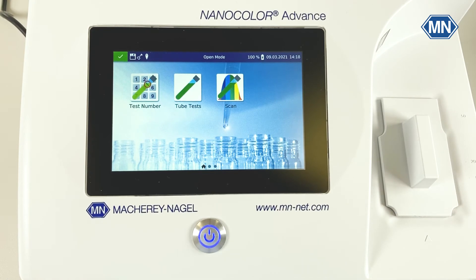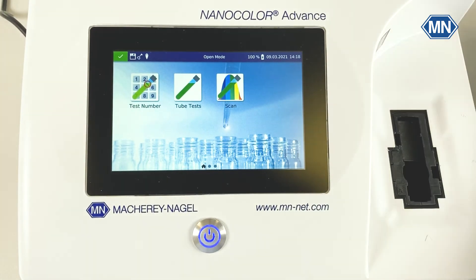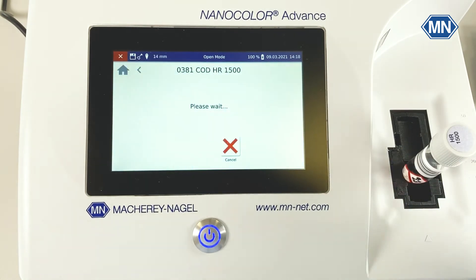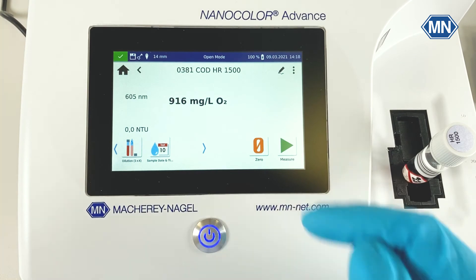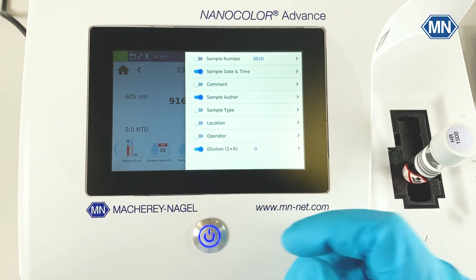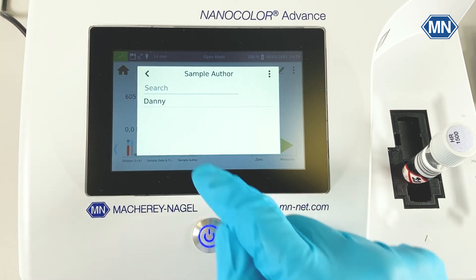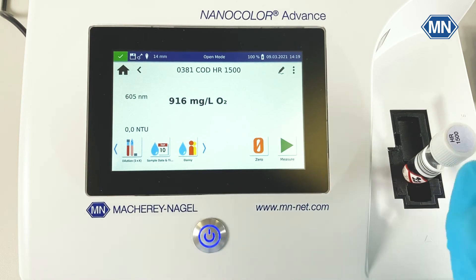The last thing I want to show you today is how easy it is to measure nanocolor round tube tests with the ADVANCE. Just remove the cuvette slot cover. And as every nanocolor test comes with a barcode, you can just insert it into the photometer, which scans the tube and chooses the right test for you. And easy as that, we already got our measurement result. This page is also highly customizable and you can choose the information that you want on this page yourself. For example, let's add the sample author and it pops up right here. Now you can just click it and choose the right sample author, and this will be saved in the photometer once you pull the cuvette.